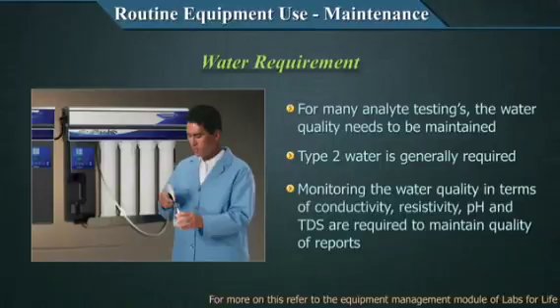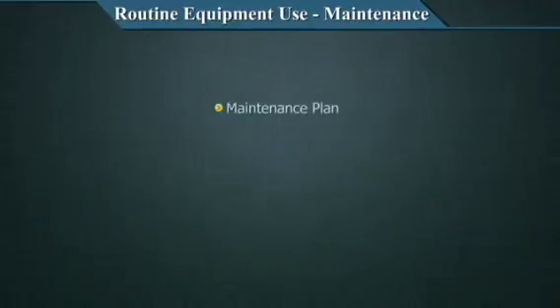In this video, we talked about the maintenance plan. Basically, we are now in the using an equipment stage, under which initially in the earlier video we talked about calibration. In this video, we talked about making a maintenance plan and implementing the plan and documenting that plan. And then we talked about certain aspects of safety: electrical safety, physical safety, and biosafety.